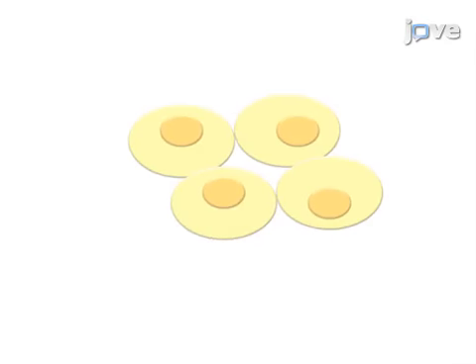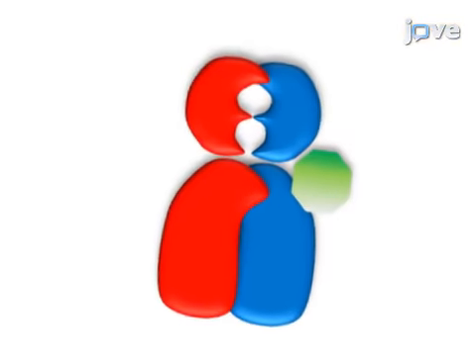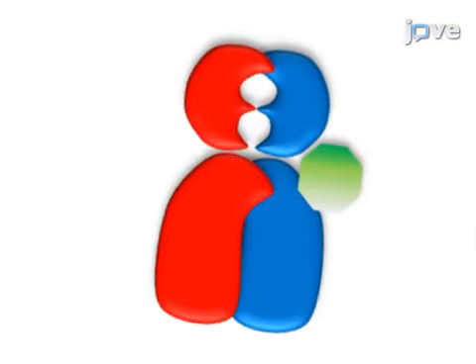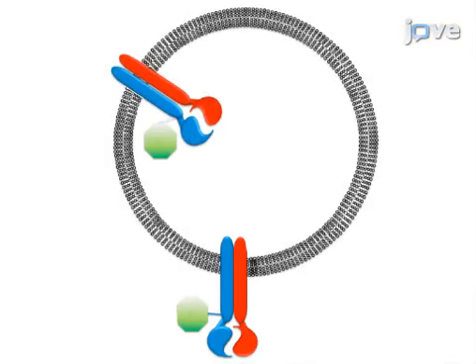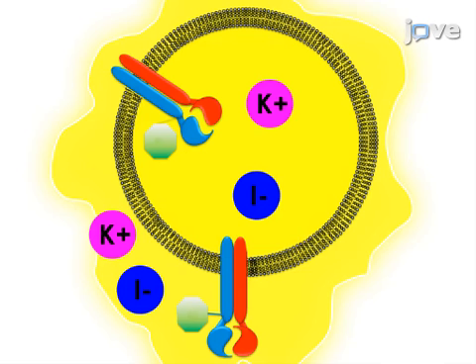This is accomplished by first purifying wild-type or mutant CFTR protein from SF9 cells using a rapid purification procedure, which yields functional CFTR protein in detergent solution. The second step is to reconstitute the purified protein into proteoliposomes of defined lipid as selected by the experimenter.